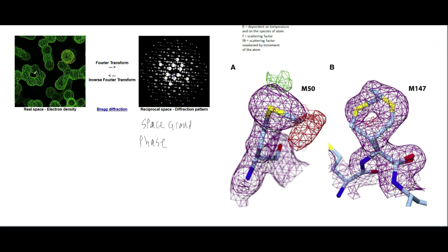You can see the little hole in the cyclic part of this, the benzene group on this phenylalanine. You can kind of see here where the side chain would go down and connect to the main chain of the protein. And so with the electron density, which we can see here in this mesh, you can model your atoms into the electron density and form the side chains of your amino acids in the protein.